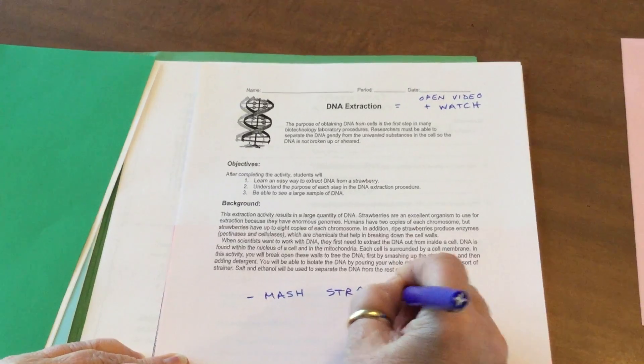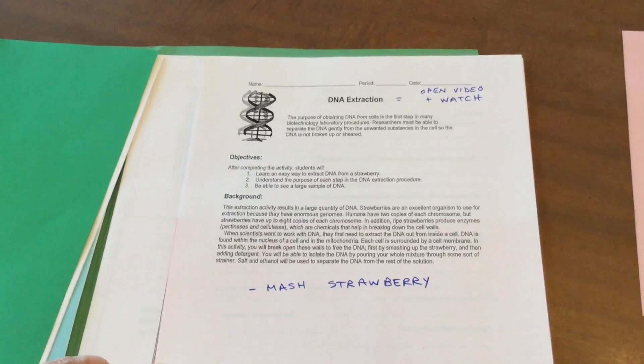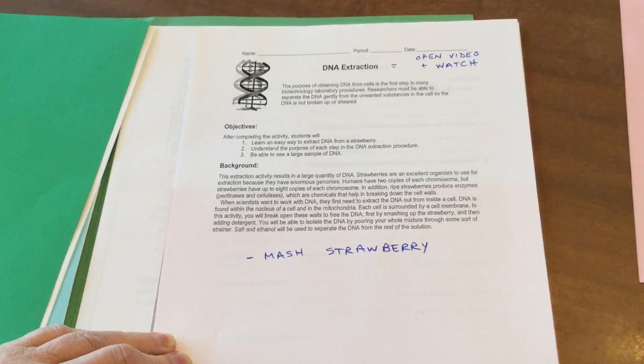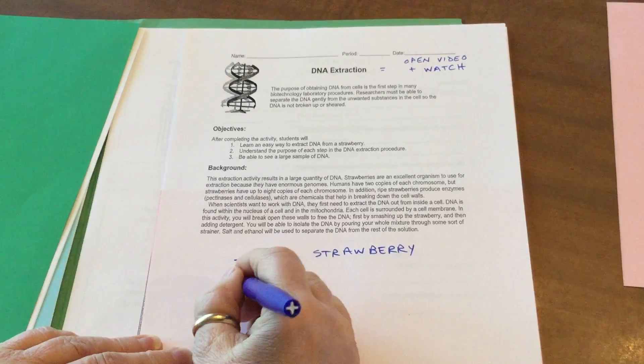Some things that they're going to do: they're going to mash up strawberries, mashing them to try to get the DNA out of the nucleus of the cells and the seeds. They're going to pop open all of these seeds by smashing the strawberries.